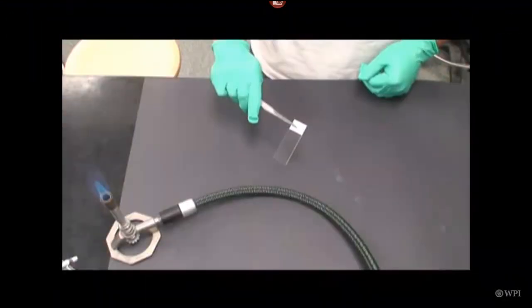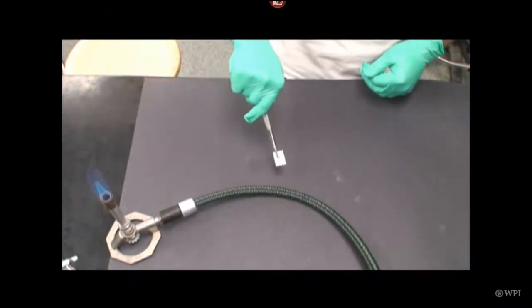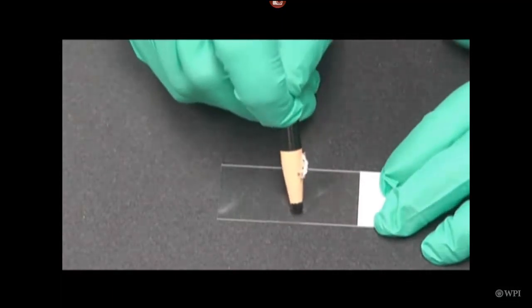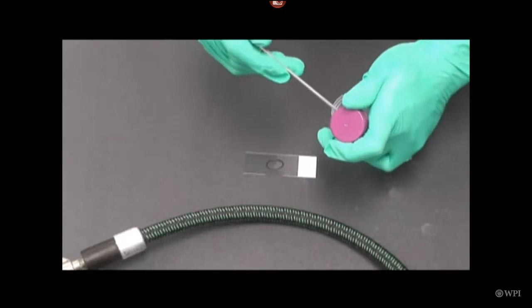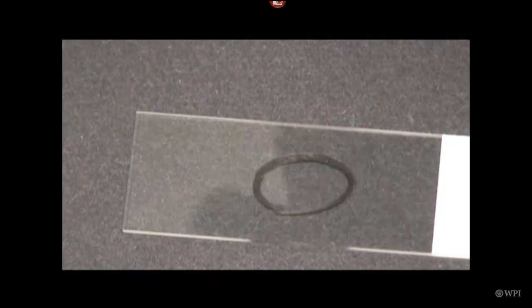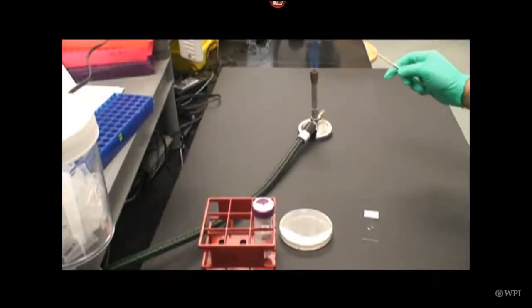Okay, how to do a simple stain. With a simple stain, all you can tell is the morphology, the cell shapes and the arrangements. And you can use different kinds of dye. In this video he's talking about methylene blue or crystal violet or safranin. So what you would do is you would make a circle, and this is how you know where to work. You're going to put your bacteria there. You would then turn the slide over, and then he sterilized his loop. What we do is we put water first, okay? And then we actually add the bacteria to the water.